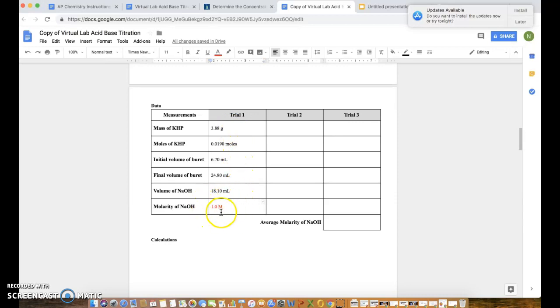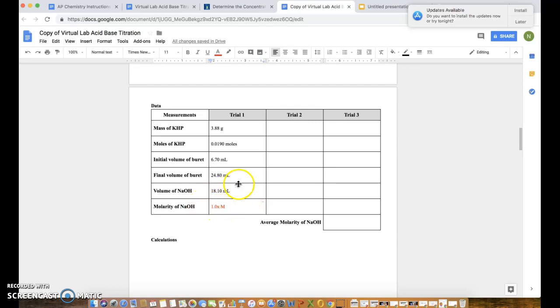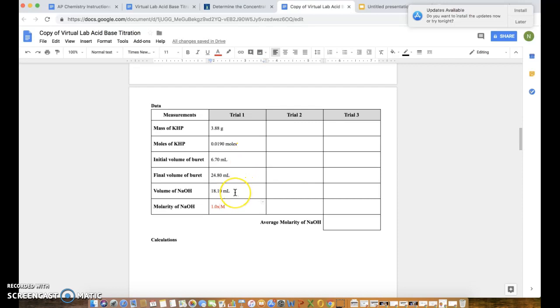I went ahead and filled out the information in the table like everything that I should have calculated. I didn't put down the actual molarity because you need to calculate that on your own, so I'm gonna put an X here. You'll have to figure out how to calculate the molarity from the volume of NaOH and knowing the moles of NaOH is the same as the moles of KHP. You'll do that a couple more times.